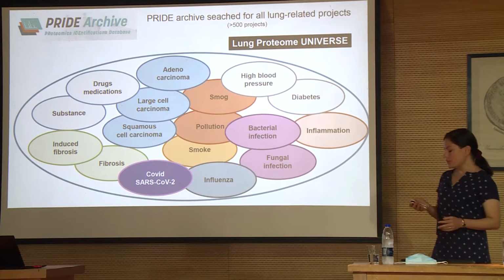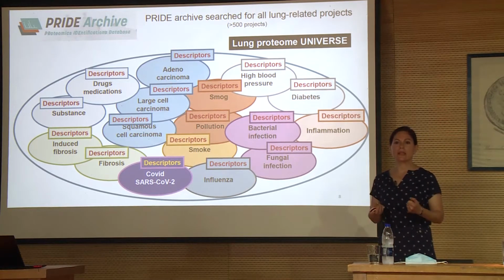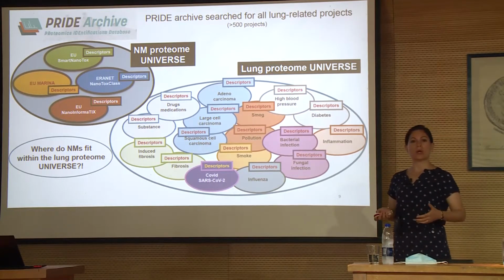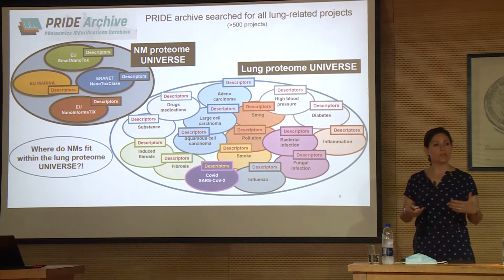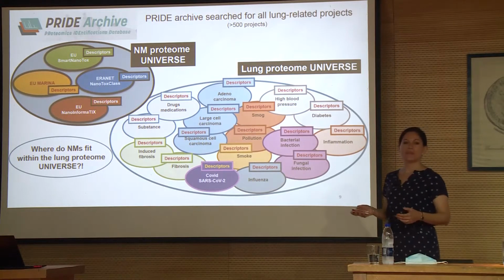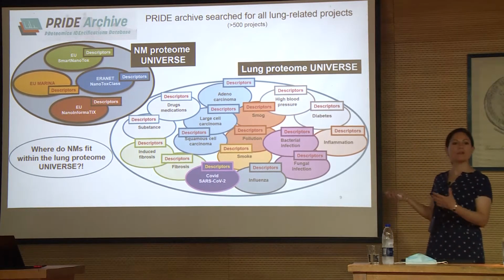We developed a workflow, and that's what I'm going to talk about today: how from each one of these projects we can get descriptors. Then we process in the same way the projects that belong to the nanomaterial part, and also data that we generate ourselves. This is what we call the nanoproteome universe. For them, we will also have descriptors. The idea is how we then match the descriptors that we find for the nanomaterials into this lung proteome universe.